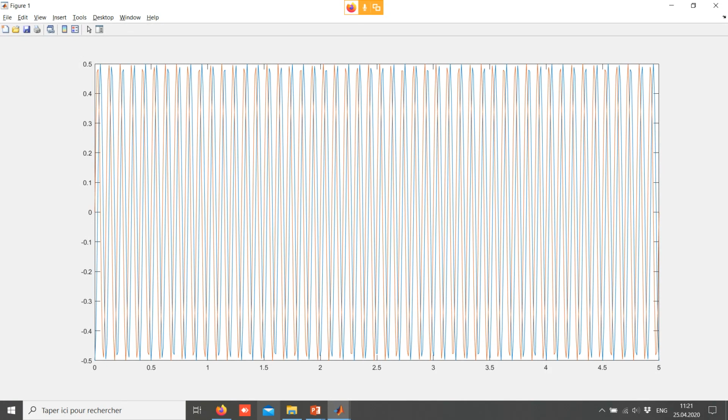Since I haven't implemented any relaxation in my model, I've just assumed that the transformation is unitary at all times. The signal is not decaying. And I cannot take the Fourier transform of the signal like this, otherwise I will have artifacts. So at the moment I take the Fourier transform, I will have to add some line broadening, meaning that I apply a window on my signal so that it decays. I will use a simple mono-exponential with a line broadening parameter.